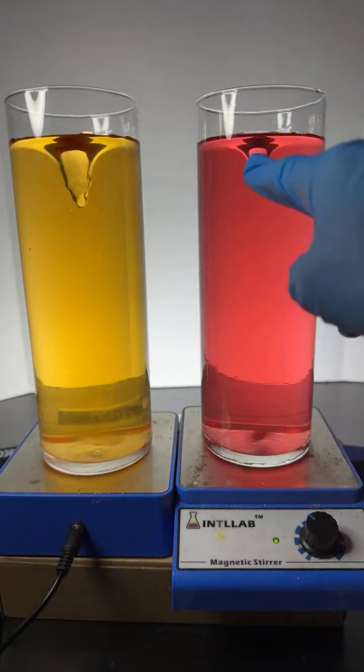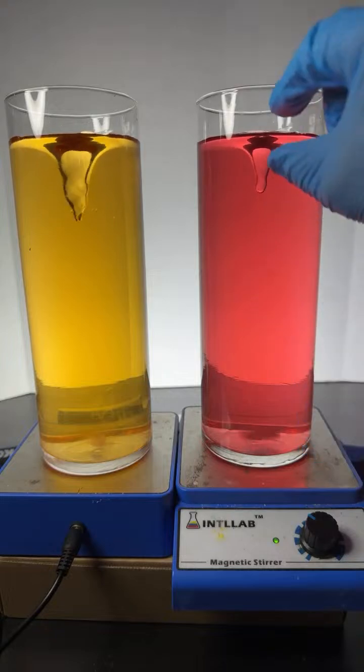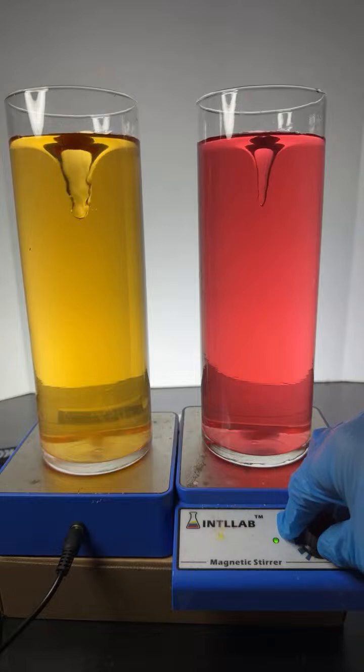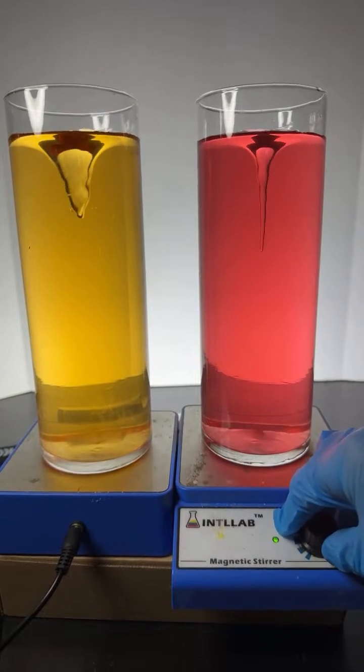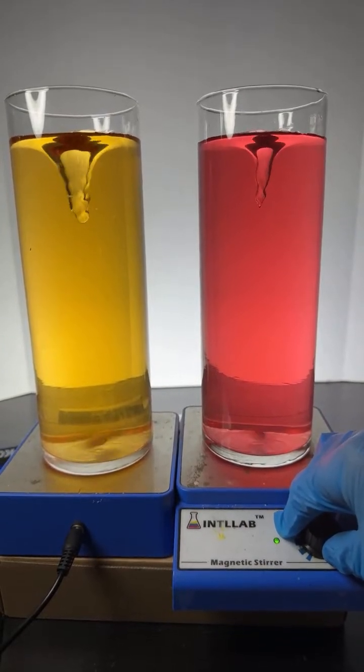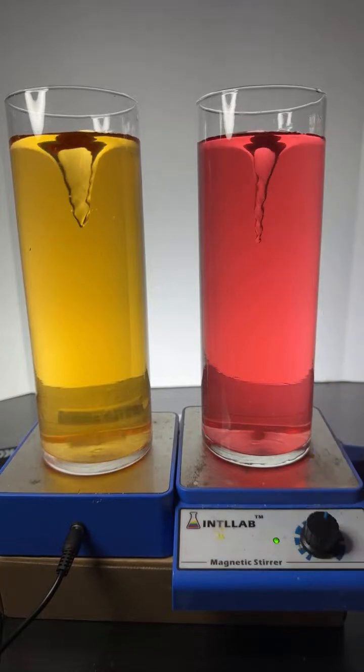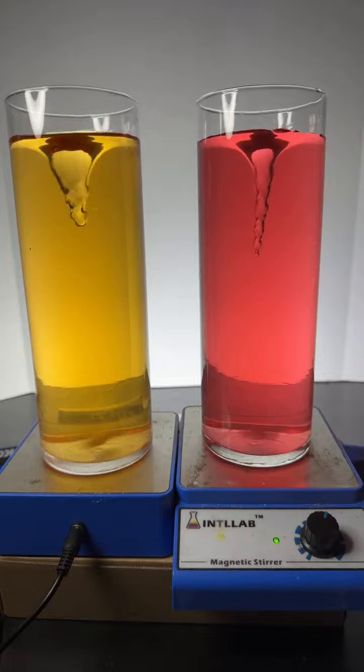Anyway, I've got this stir bar stirring at a certain rate. You can see the size of the funnel. Watch what happens when I turn up the speed right here. So Natalie wants blue. All right, I got it turned up, and you'll notice that the size of the funnel is larger.